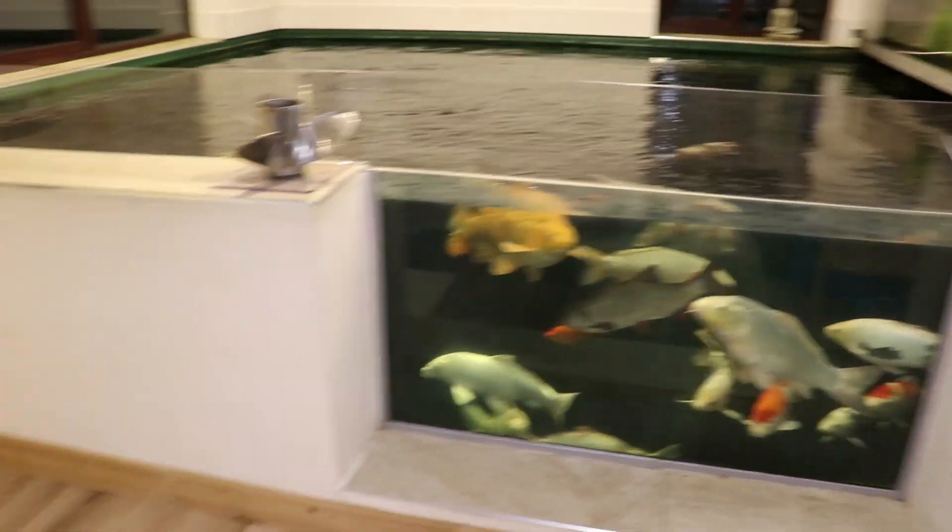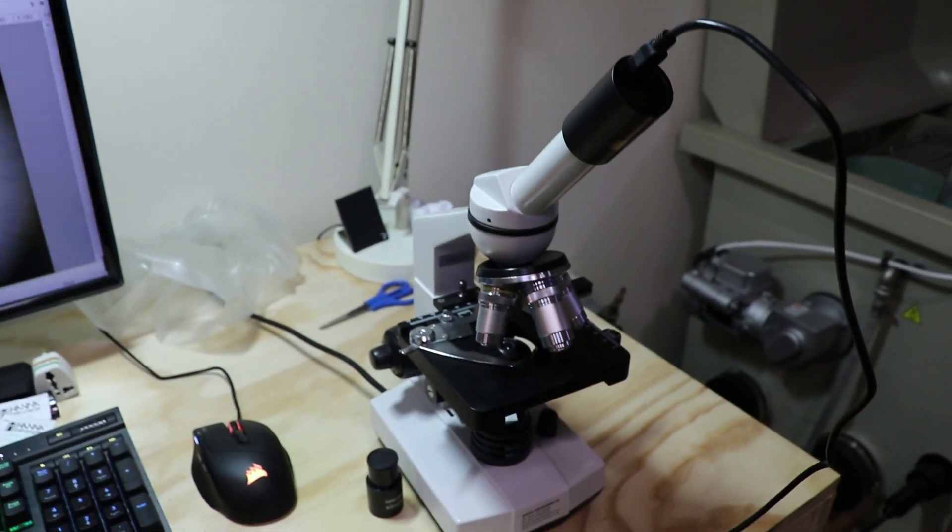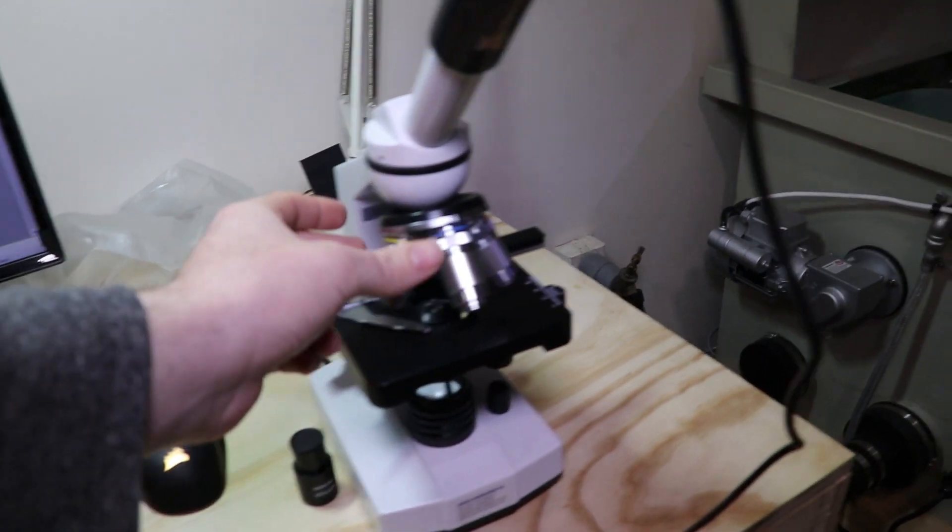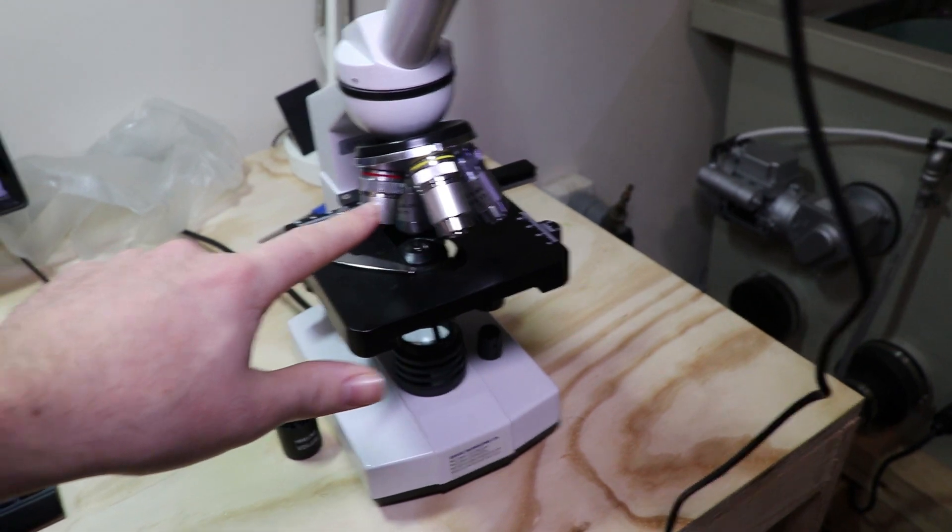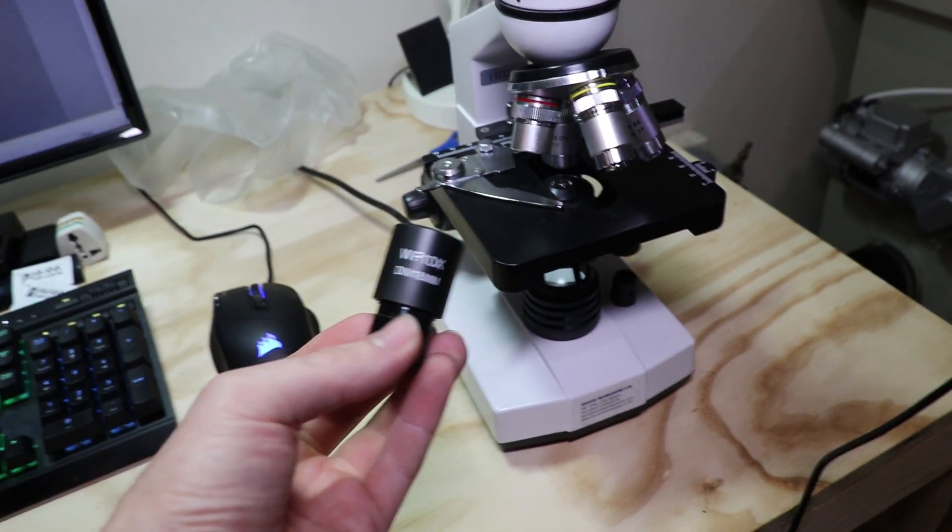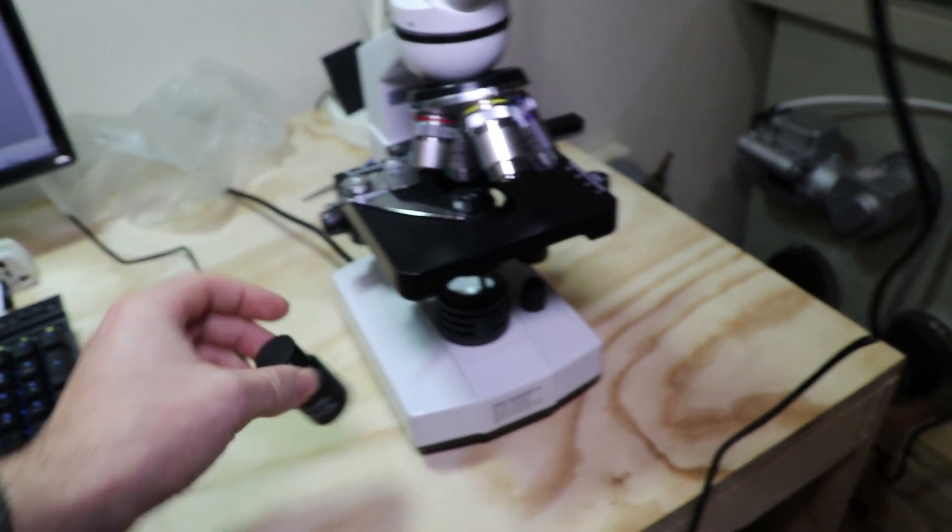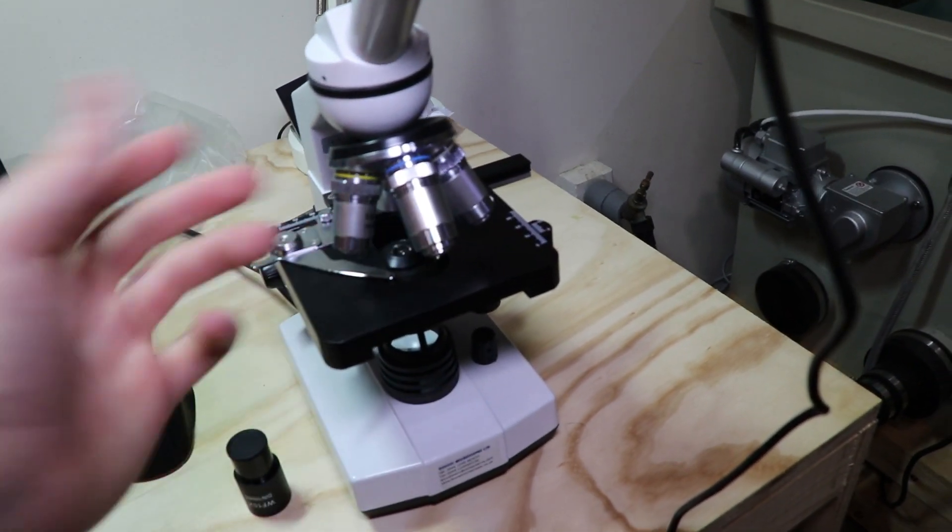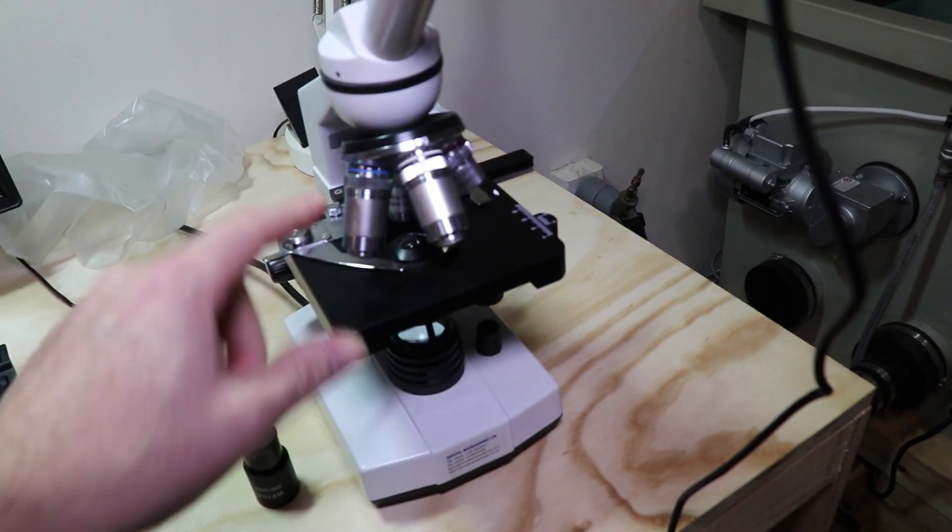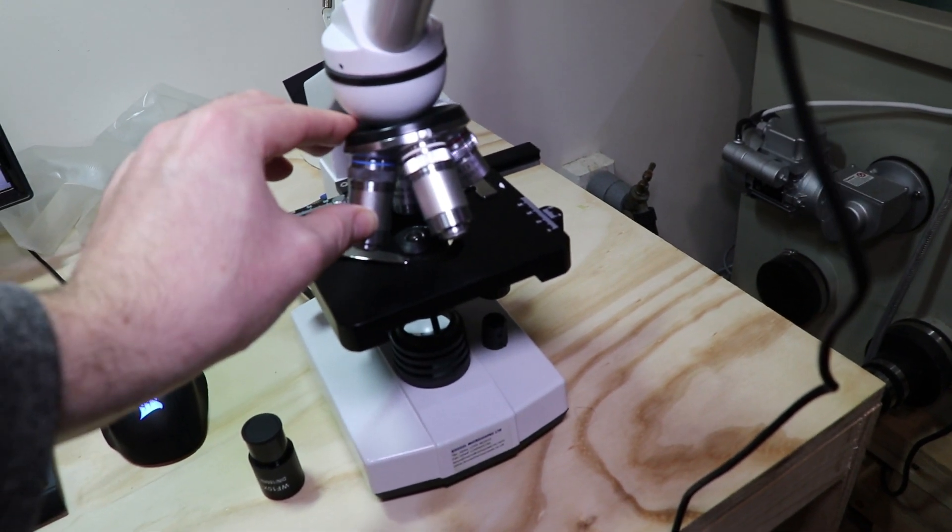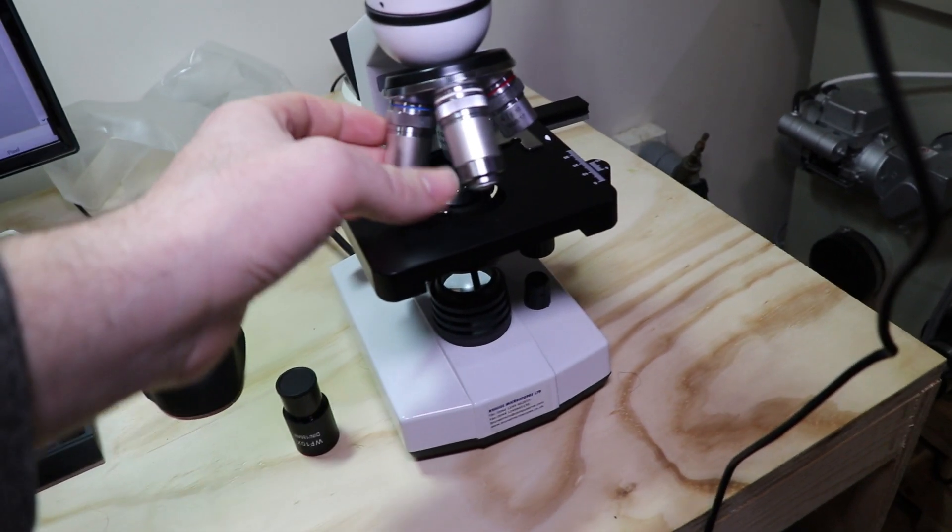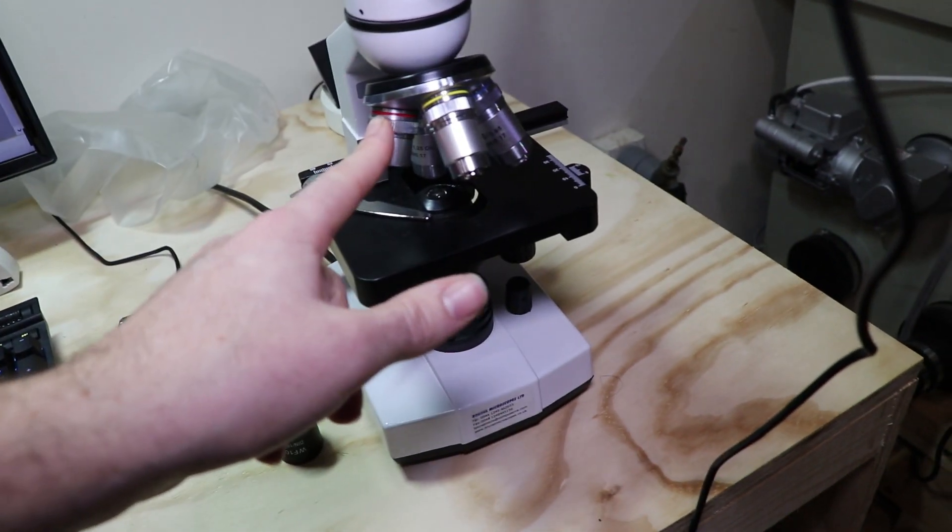So let's have a look at the microscope we're going to be using. Here is the microscope I'm going to be using, it's a Brunel SP22. It's quite a good microscope, I really like using it. It has four options for magnification. The first one is 4x which when compared with a 10x eyepiece makes it 40x magnification. Then the second one is 10x which makes it 100x. The third one would make it 400x, and the fourth one which I never ever use is 1000x in total.